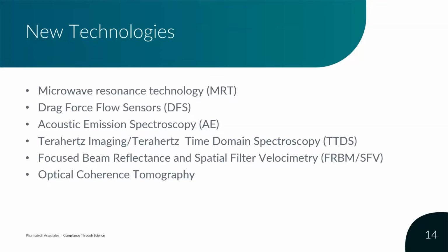technology. Optical coherence tomography. This is like an ultrasound, except instead of sound waves, you're going to use light. And using that, you can image internal structures that can provide you a lot of data on what the internal structure of your tablet looks like, and thus what you can expect the critical quality attributes of that finished product to achieve.